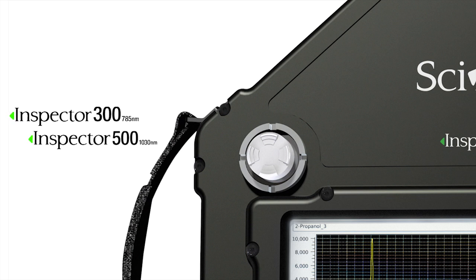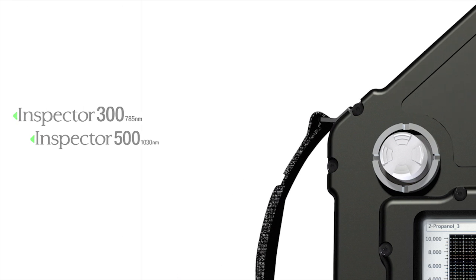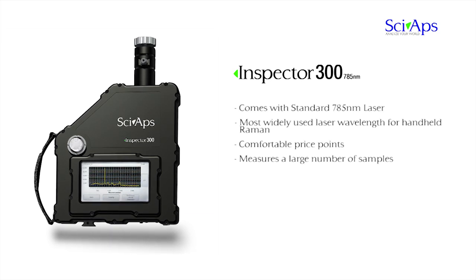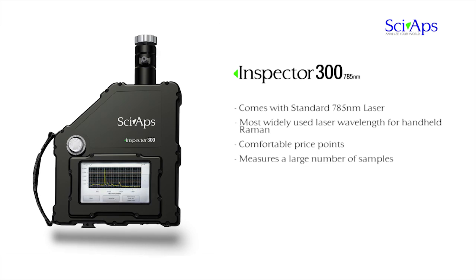CyApps is also pleased to introduce the state-of-the-art Inspector models. The Inspector 300 is equipped with the standard 785 nanometer laser, the most widely used laser wavelength for handheld Raman because it balances the ability to measure a large number of compounds at a comfortable price point.